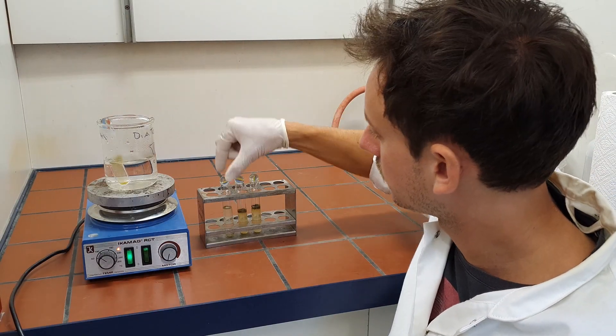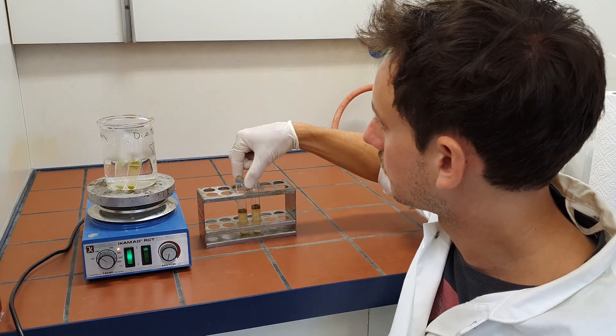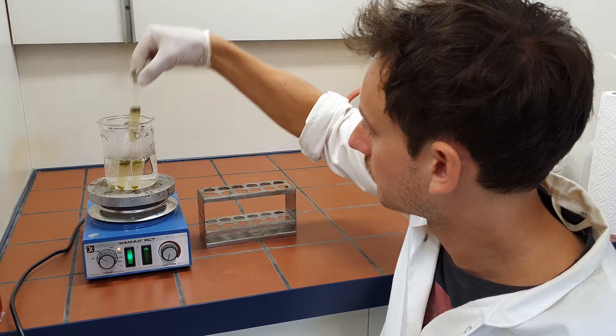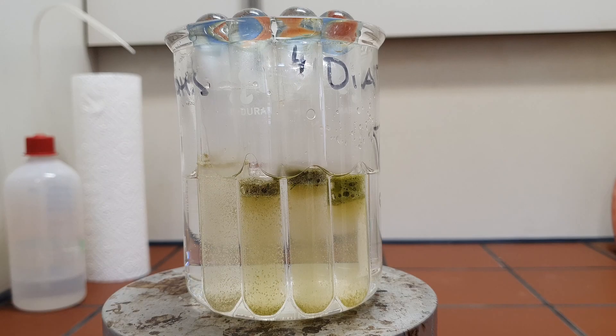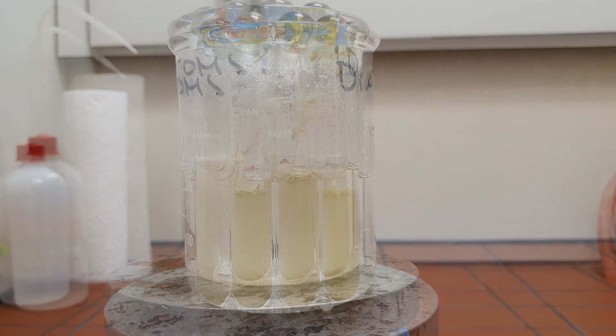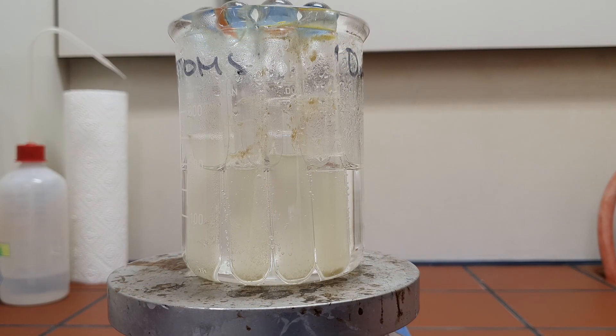Transfer the glass tubes to a beaker with hot water and heat for approximately 2 hours at 100 degrees Celsius. Depending on the organic content of the sample, it takes around 1–2 hours until all organic material is oxidized. As a result, the reaction dies down and the material is bleached out. If some organic content remains even after 2 hours of boiling, add more hydrogen peroxide and continue with the reaction until all organic material is removed.